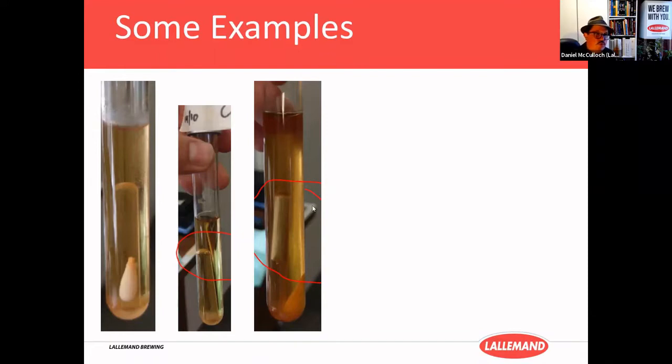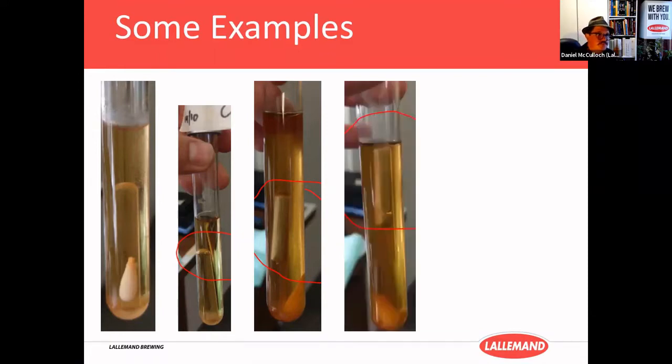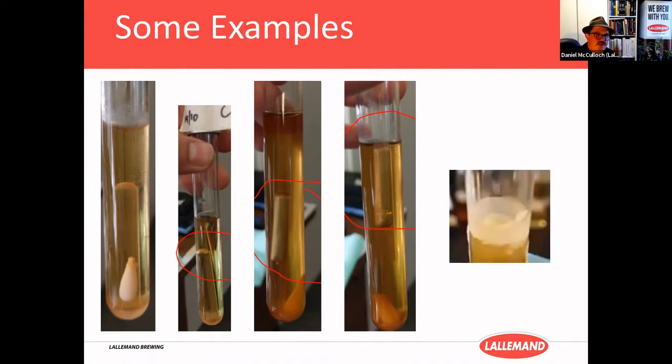And what you can do is pour Durham tubes into other tubes. There's a real high version of it, where it's actually managed to float the tube. And here we can see some background contamination of something else that's happening, which would be Brettanomyces forming its pellicle on top of the tube.